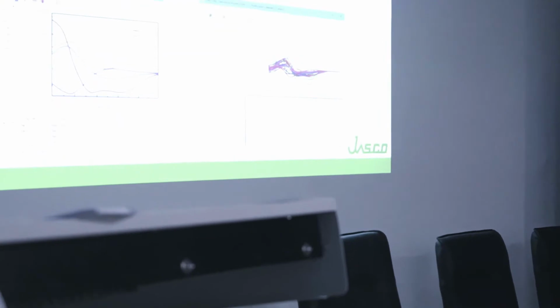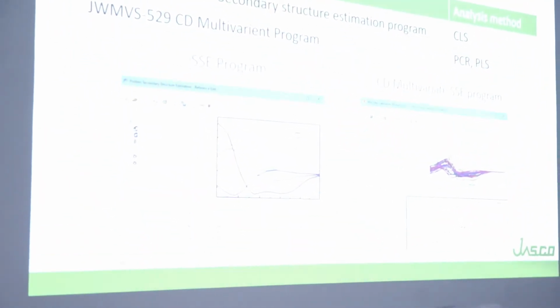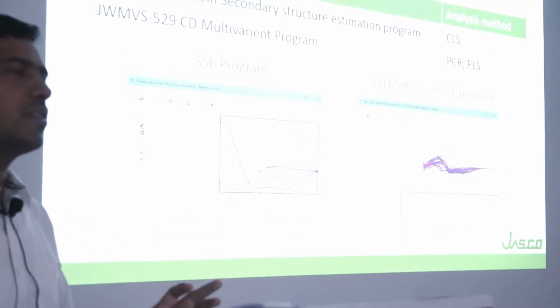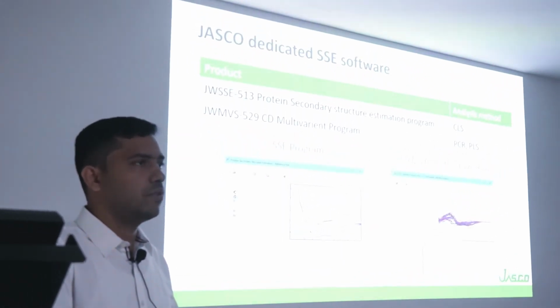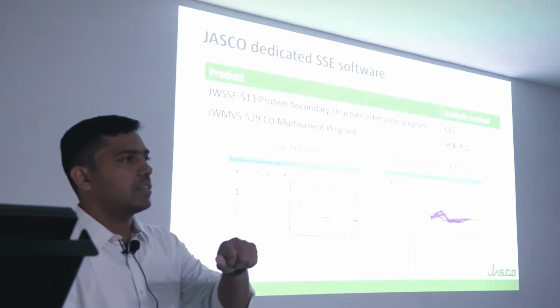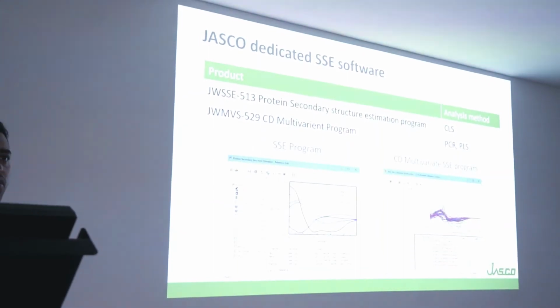In SATHI also we very much depend on these particular libraries. Even not in SATHI, you can go to online sources as well. There are different libraries; you can study them if you want to analyze your data, and get a good understanding. So it depends on what kind of protein sequence you are going to be studying.